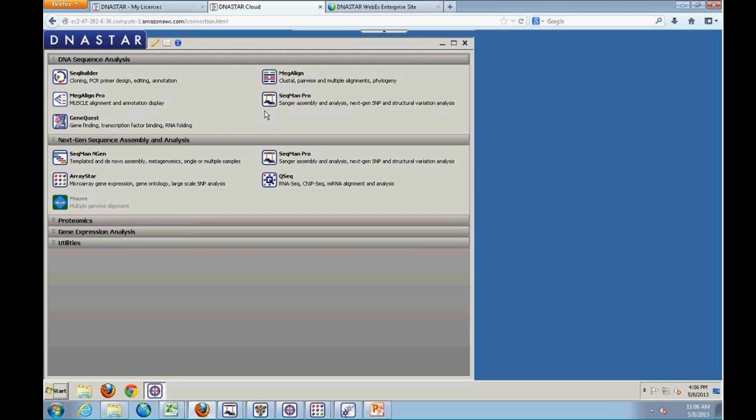Yeah, we had one question that came in, Jackie. Someone was wondering how secure their data would be on the DNASTAR Cloud. That's a really, really great question.